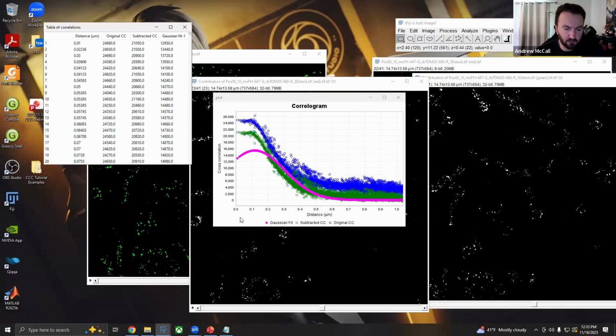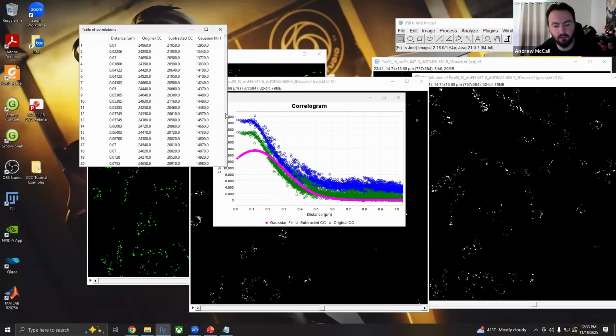Does not happen too frequently. And you can see it still fit pretty close to where it should be. And especially if you have multiple images for your experimental repeats, it should not be a major problem.